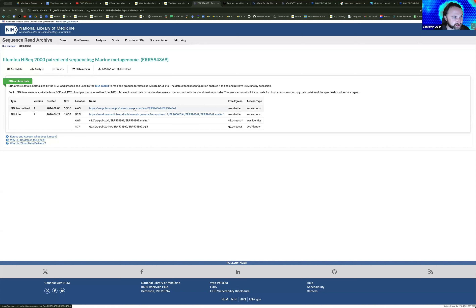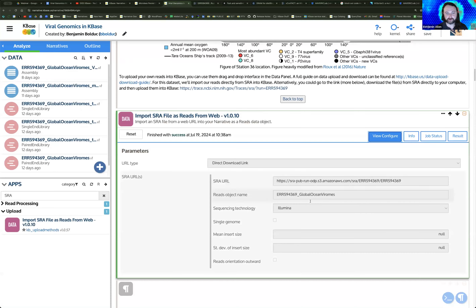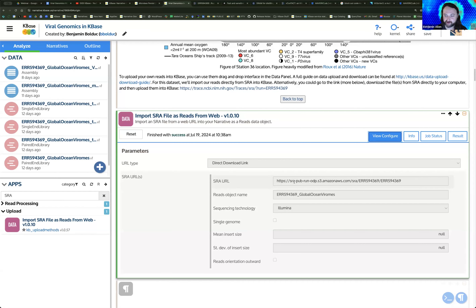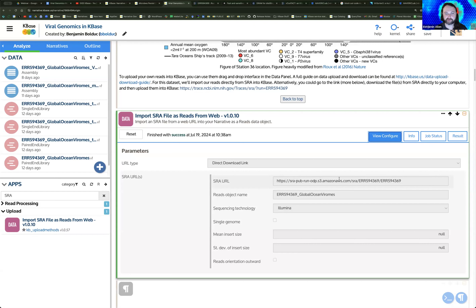If you follow the link to the SRA record and you're looking for the URL to drop into this tool, go to the Data Access section at the top and find the link to the Amazon Web Services FTP where this data is hosted. That's the URL you drop into this section of the app to import that data. Between the last example and this current one, that has changed — these things are always changing, so we have to go and update and make sure we're able to link to external resources and pull in data.